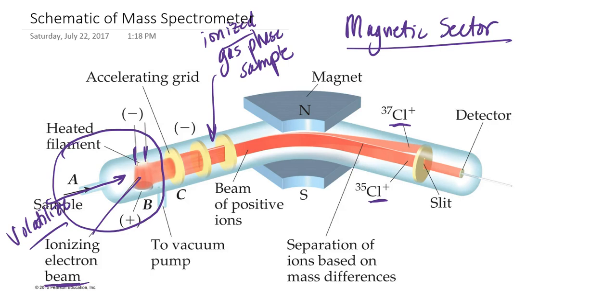But it is possible and sometimes done to carry out mass spectrometry in the negative ion mode. And so once we have our ionized gas phase sample, then we want to eliminate any possibility that our gas phase ions might collide with air particles and thereby alter their path within the instrument. And so for that reason, we have to apply a vacuum to the interior of the mass spectrometer so that the space is completely empty and the gas phase ions will have freedom to travel from one end of the instrument to the other without colliding with any air particles.